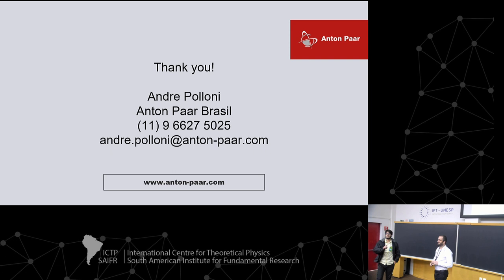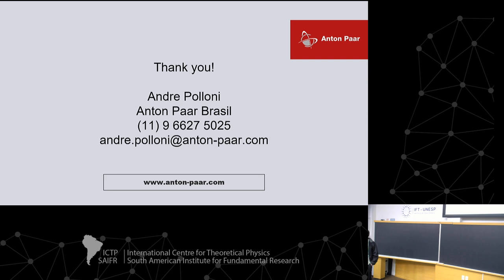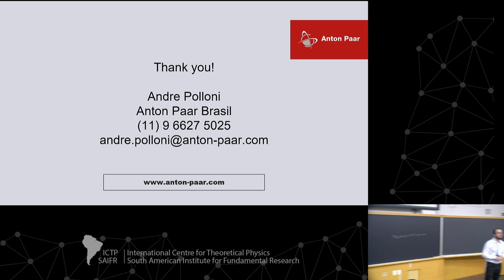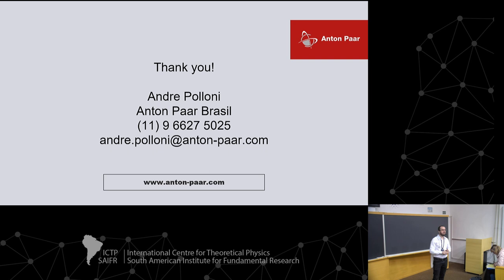Hi, André. Very nice pictures and data. What is the minimum typical volume or mass, let's say, when you investigate with the rheometer? Oh, that's a good question. It's higher than when you use it without the rheometer head, but I'm not quite sure right now. I can take a look and give this information to you. The amount of sample is more related to the rheometer head we have, with different sizes and different geometries. But I believe it's around 0.5, maximum 1 ml or gram.